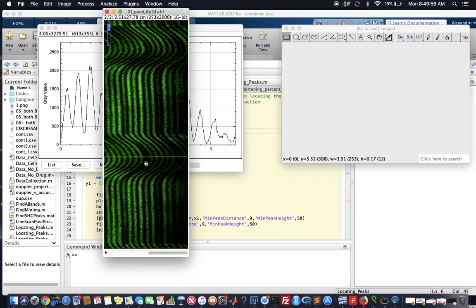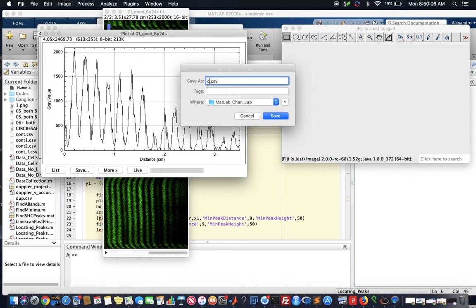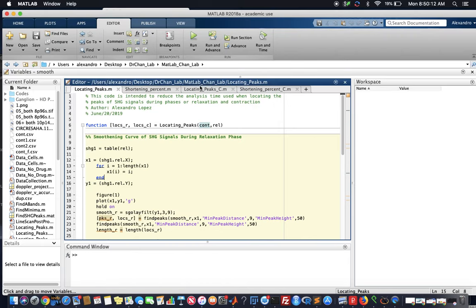And there we go. Maybe make that a little smooth there. Alright. Save this one here. CONT. Once again, you'll see why in a minute. Go ahead and save that. Replace. Alright, we're going to go back to this.